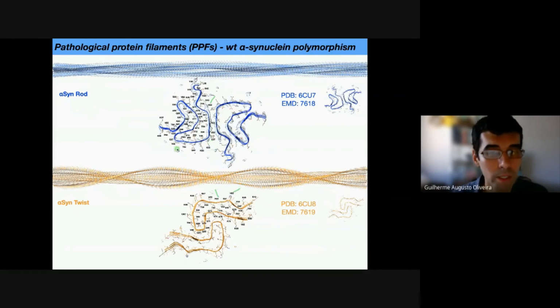We also have some ideas on the distortion side. So the polypeptides are pre-distorted, right, in these regions, and we have short side chains in these strong distortions in here, like glycine residues, valine residues, alanine residues. And the core is also pretty much hydrophobic. And again, what we can really learn from having this kind of near atomic resolution detail on different polymorphs is that we can try to figure out the forces that hold the filaments together, right?